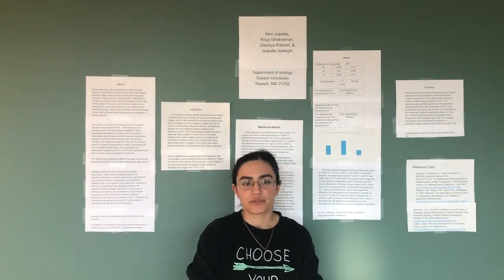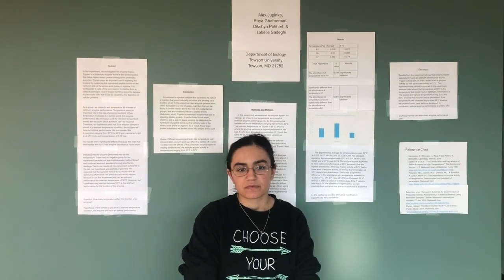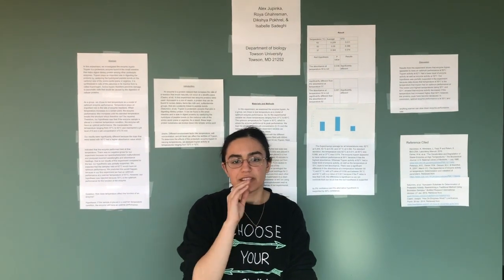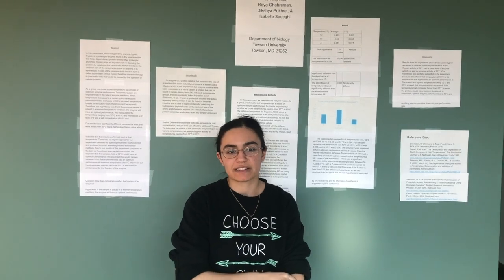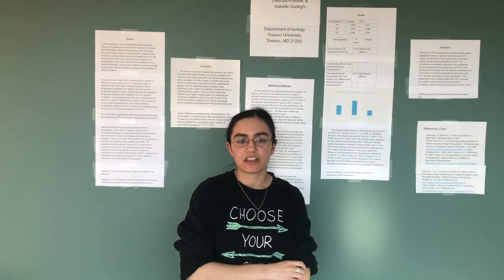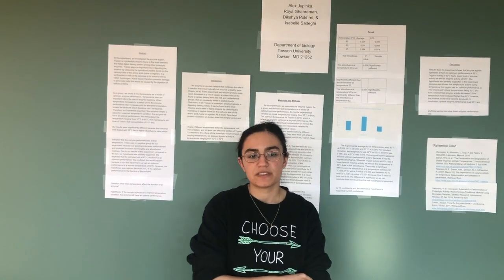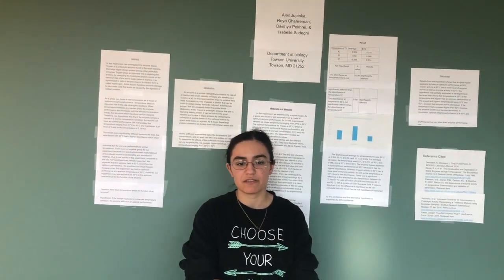I think our choice of control variable conditions resulted in the highest possible rate of enzyme activity. We maintained a pH of 9 because 3 groups tested pH and the optimum level was 9, because trypsin had a better performance at a higher pH level.